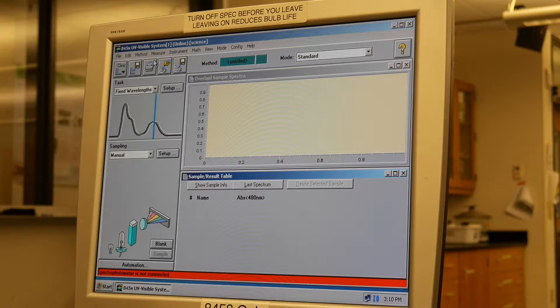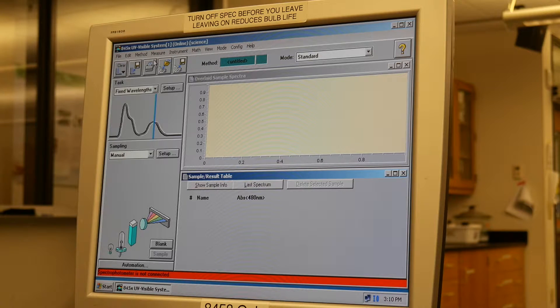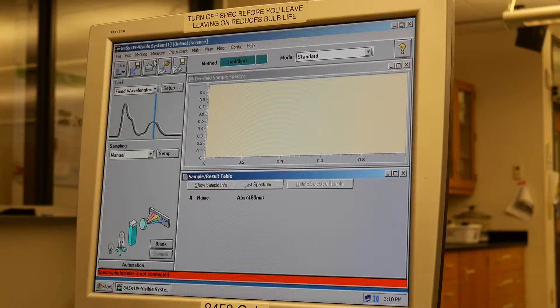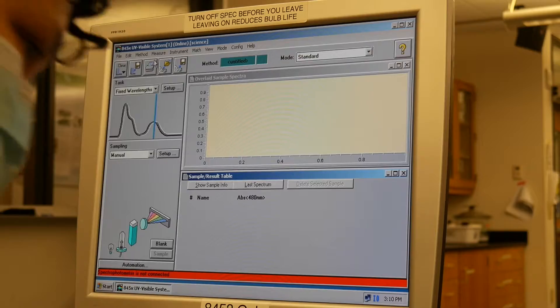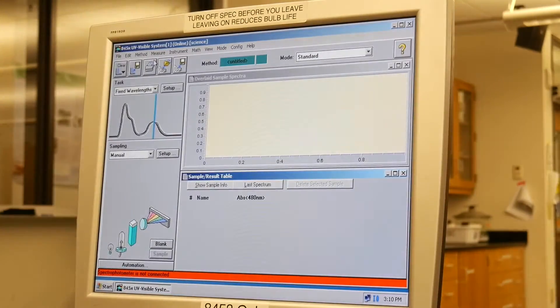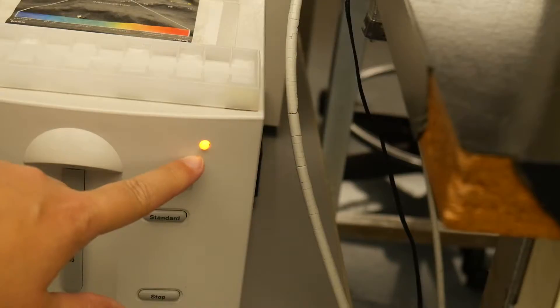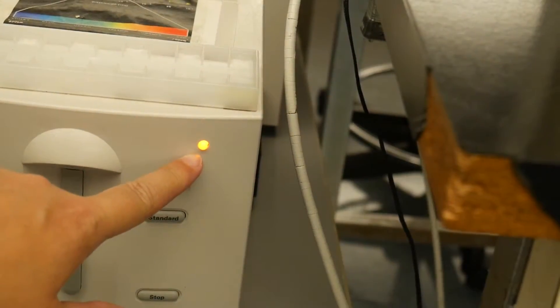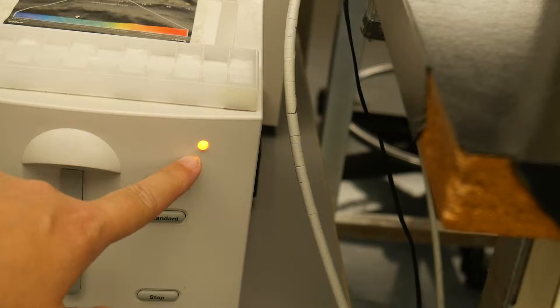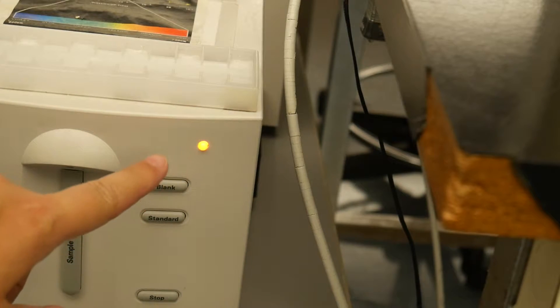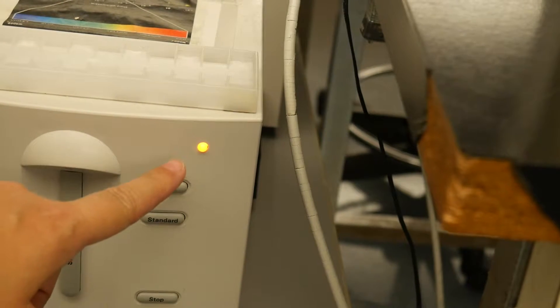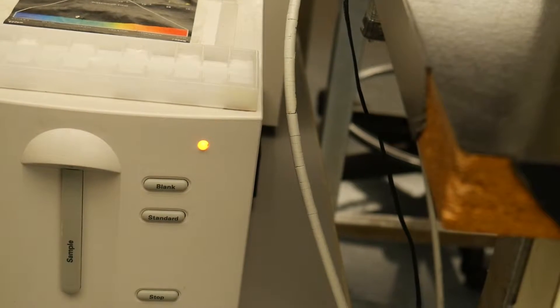So the software is up, but we also need to get the instrument online. So we're going to turn on the instrument with the power button, and this light right here tells us that the instrument is on.